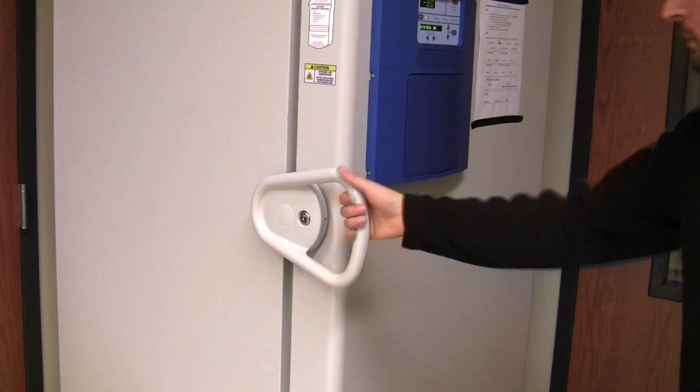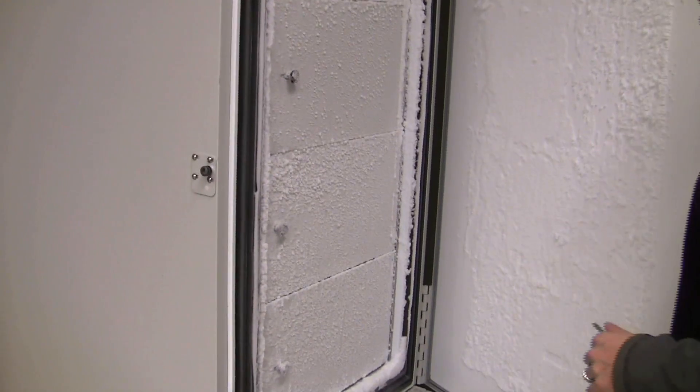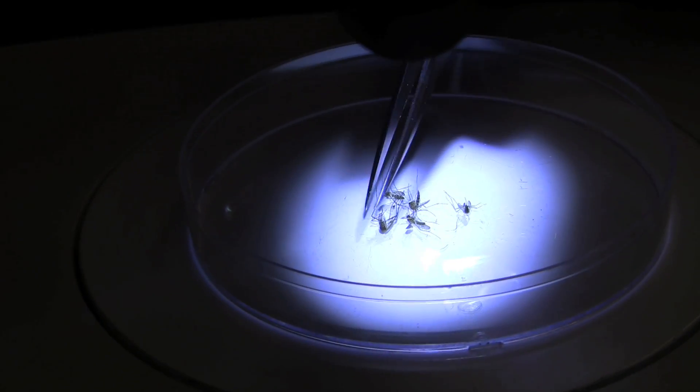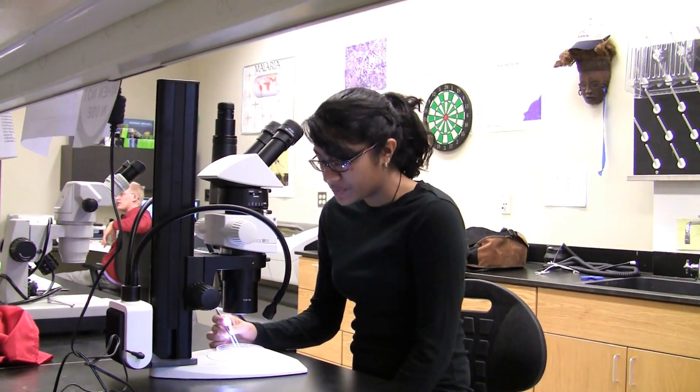We use collection caps, which are basically plastic caps with a metal mesh. We can knock the mosquitoes down by placing them in the freezer for five minutes — it's like an anesthesia for mosquitoes. After that we can sort them by species and gender and look at different physiological status.